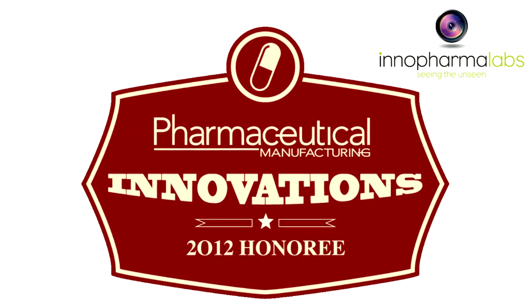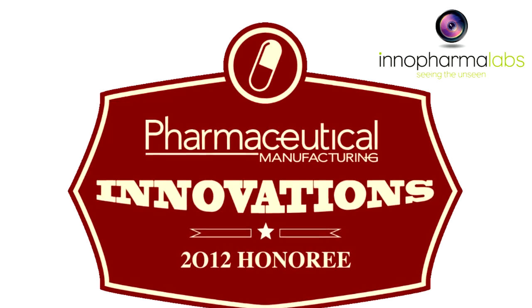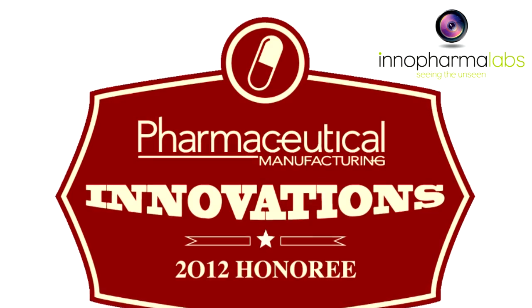The ICON is a small form-factor, non-product contact instrument that provides real-time particle size and shape information for process control.